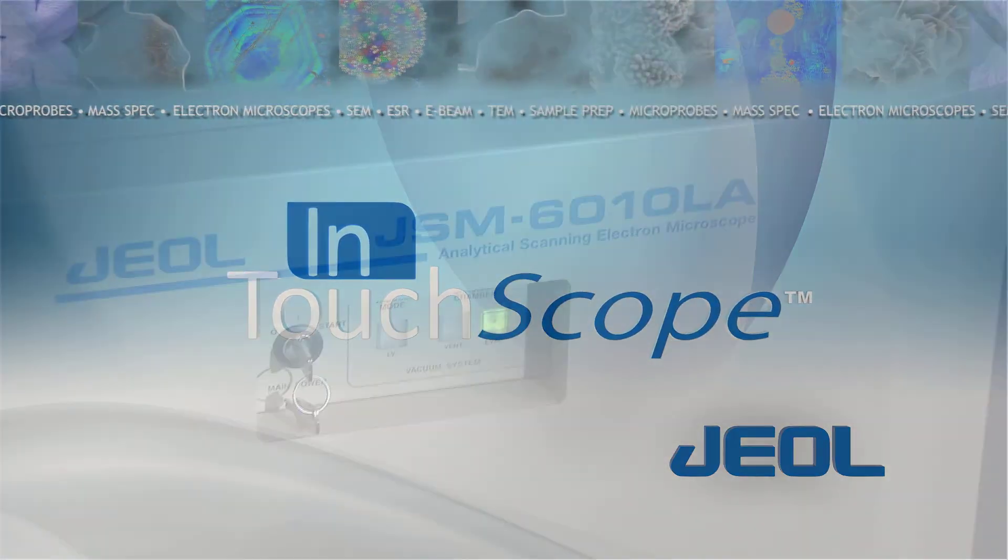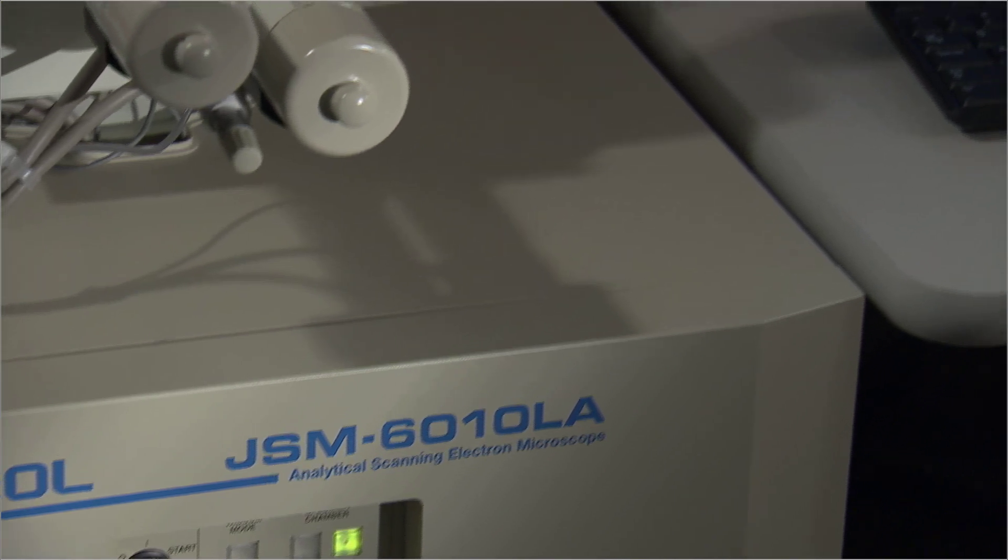The JEOL InTouchScope is a compact, portable, research-grade SEM that offers versatility and exceptional value for any lab.